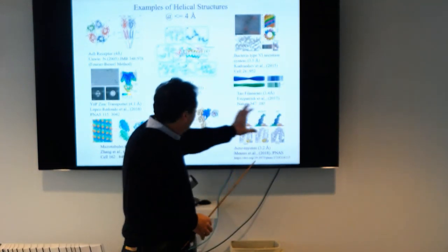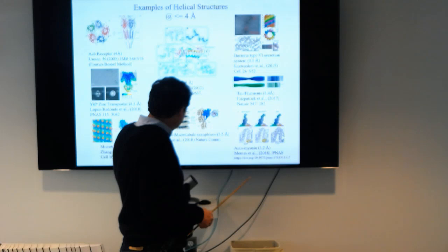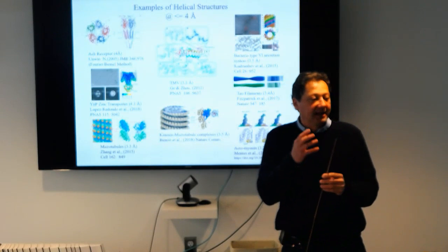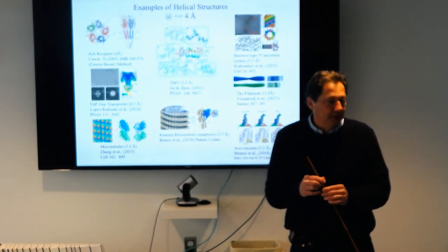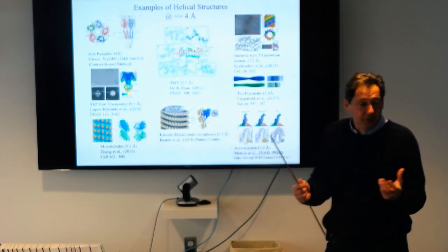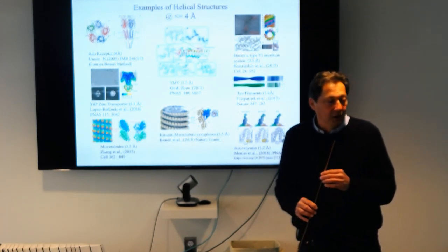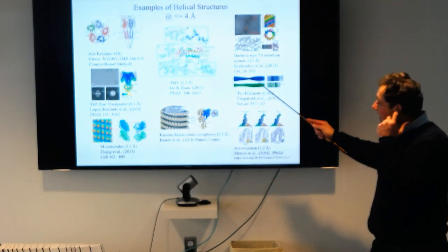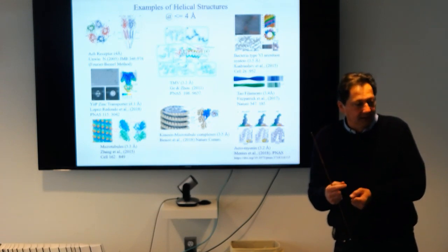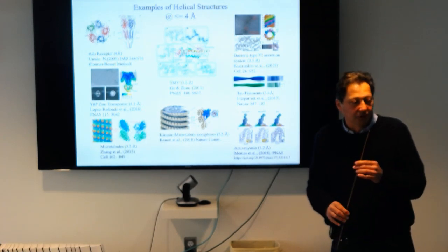To study kinesin or myosin with actin, I would say that's the ideal technique. I mean, that's the natural substrate. That's where the protein generates force. That's what they do. So you actually can see them interacting with the microtubule. There are a lot of crystal structures, but interacting with the filament, that will be the only way. And also, with a tau filament, anything that is biologically a filament, probably the natural way to analyze it would be with some sort of helical reconstruction method.